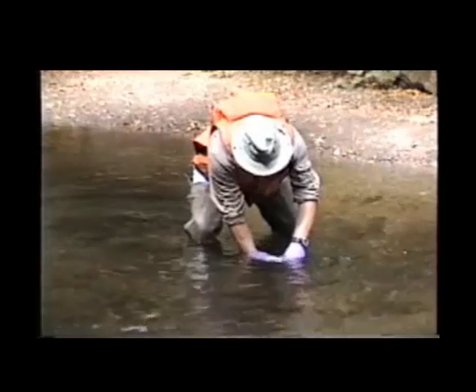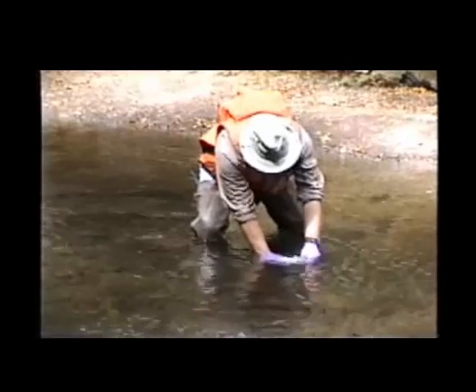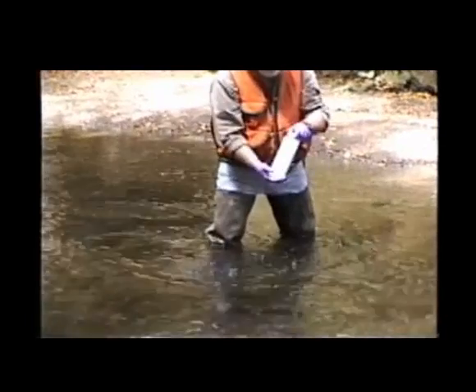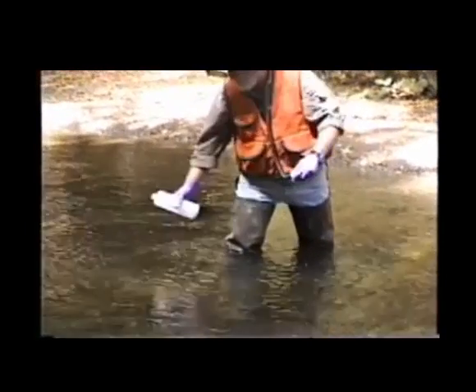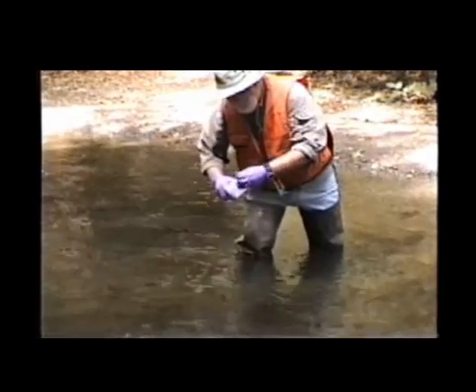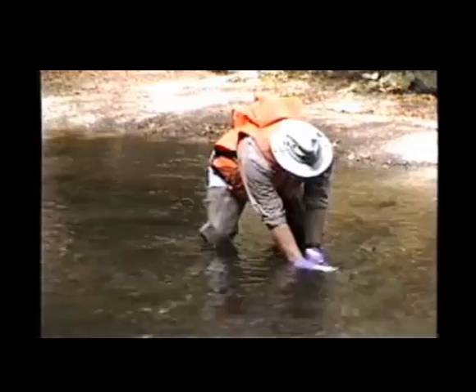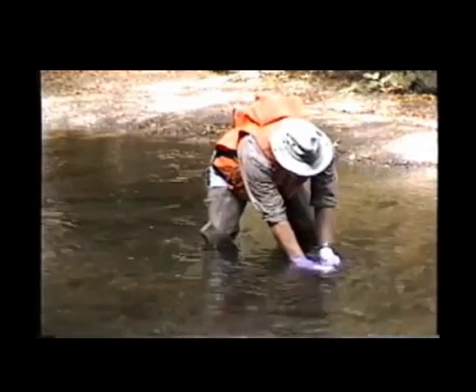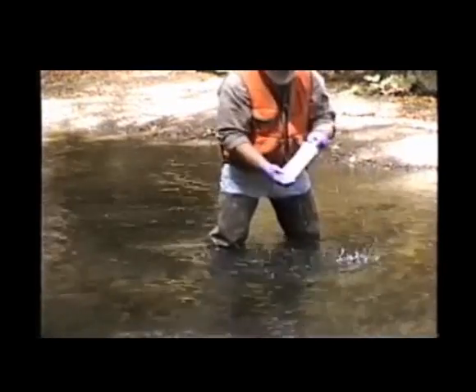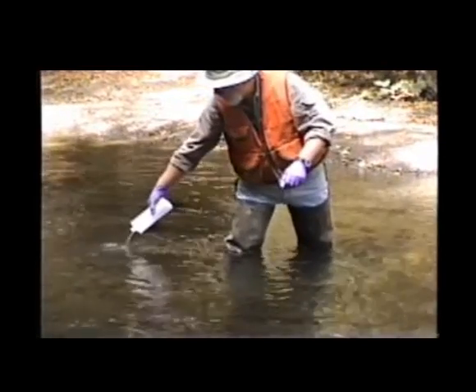Uncapping the bottle underneath the water, letting the bottle partially fill, capping the bottle underneath the water, flushing the bottle, discarding downstream. Third time. Flushing the bottle, discarding downstream.